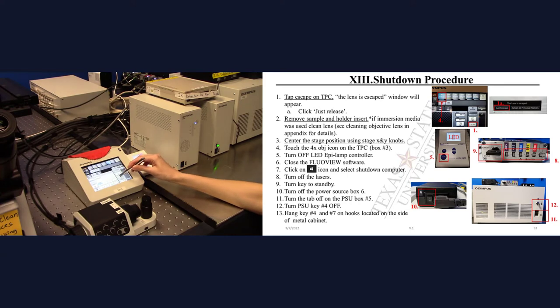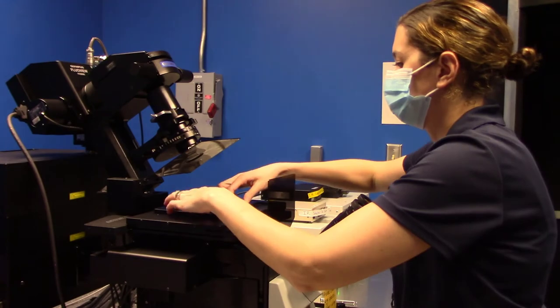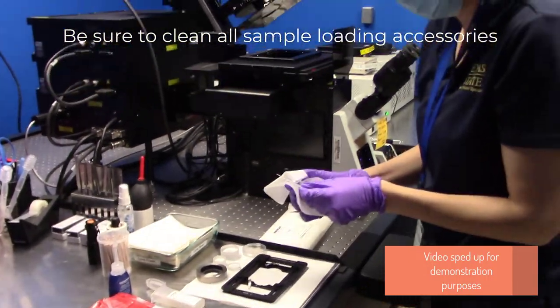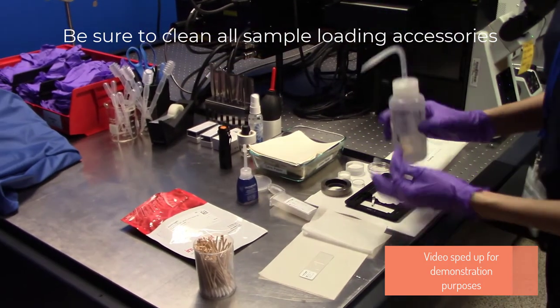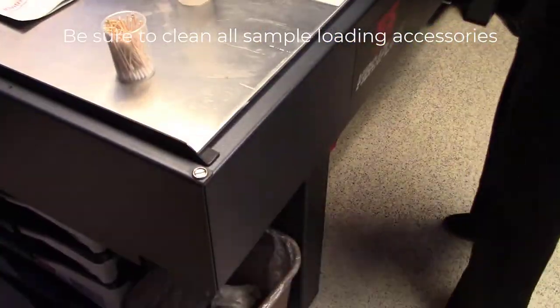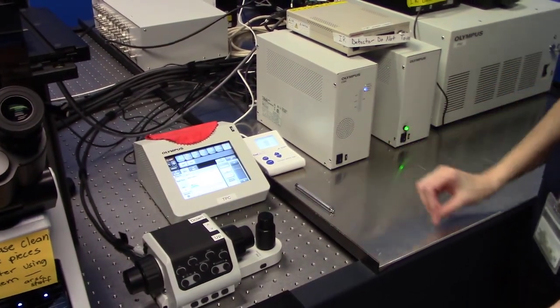To shut down the microscope, tap Escape on the TPC. The Lenses Escaped window will appear on the monitor. Click Just Release. Remove the sample and holder insert. If immersion media was used, clean the lens. Center the stage position using the stage X and Y knobs. Next, select the 4X objective icon on the TPC box number 3.